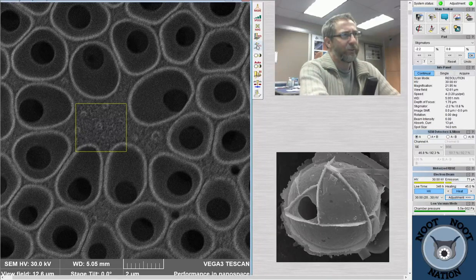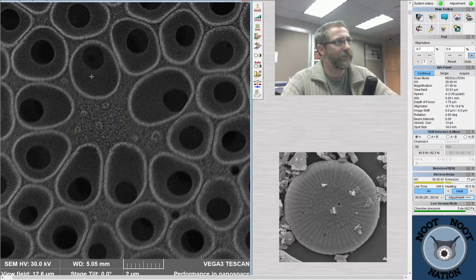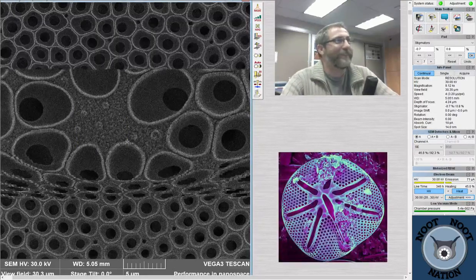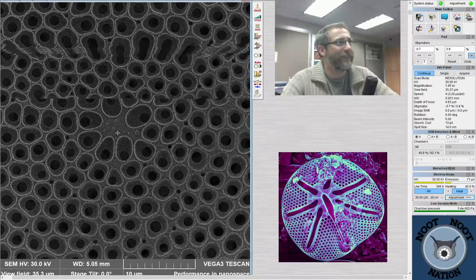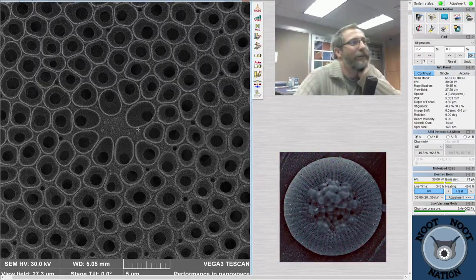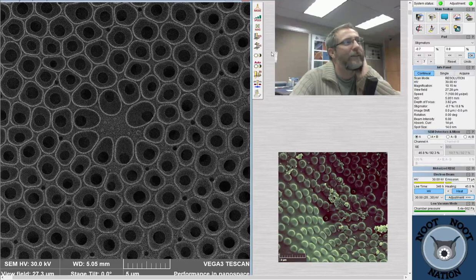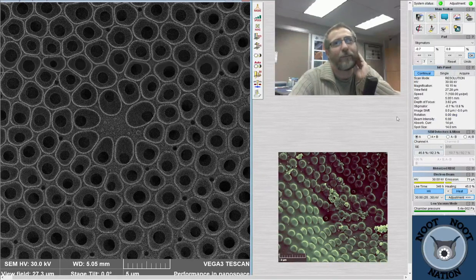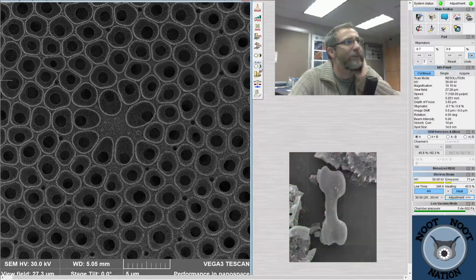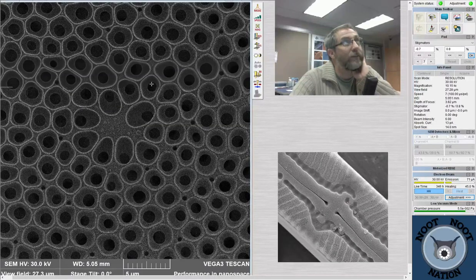Just sharpening the focus a little bit. Ah, that feels so much better. It just looks good. Look at it. Would you look at it? Oh my gosh. The holes are just absolutely stunning. I think we need to be somewhere in here. I feel like I could make that into art you could hang on a wall. You know what I mean? That's just a good one. Okay. Beam intensity is down to 6, so we got a really clear image. I'm going to play with the brightness just a little bit, and then I think maybe we'll do a longer shot for this one. That's just pretty.